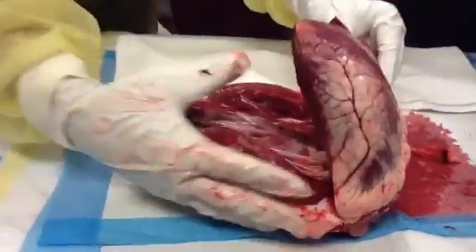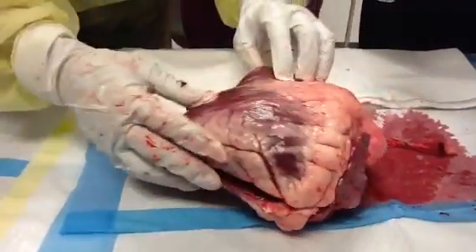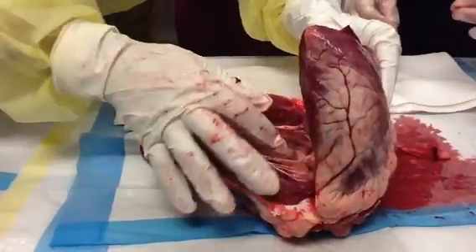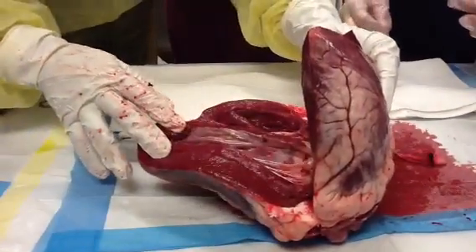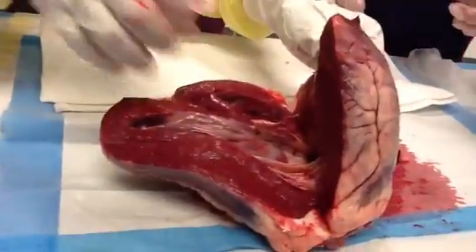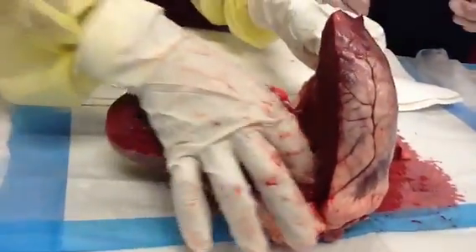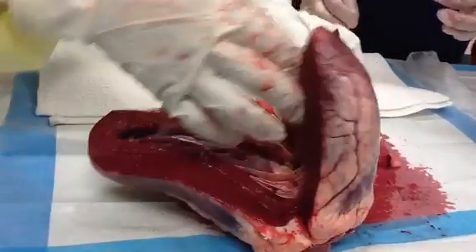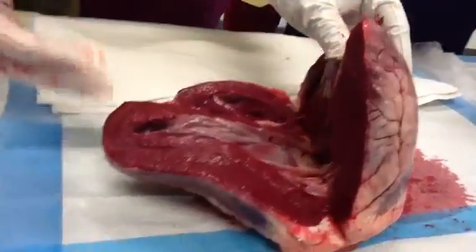So this is where it pumps out. This is obviously the right ventricle. What's that called? That's the chordae tendineae. Those are cool — they're like little ligaments that flap open the valve. Whenever the blood comes in through the ventricle, they shut, and then they open as they go through.